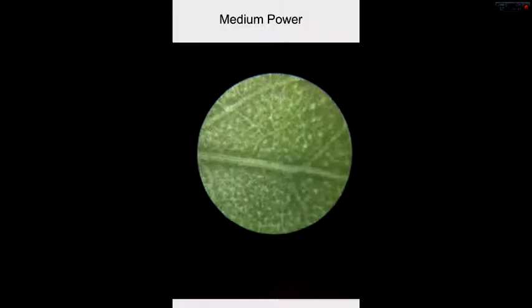Then we're going to be putting a few drops on the leaf — not a lot, just a little — and place a cover slip over it. Once we have finished that step, you're going to be putting it under the microscope.